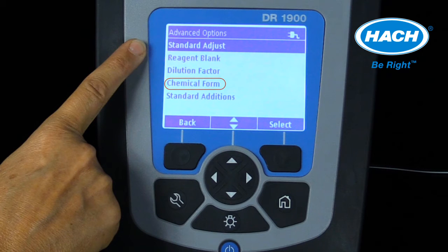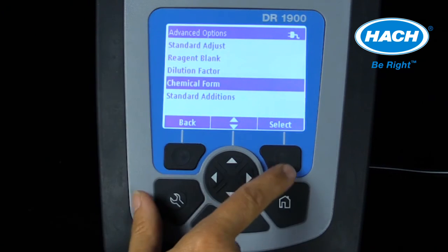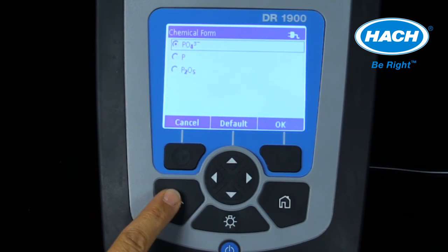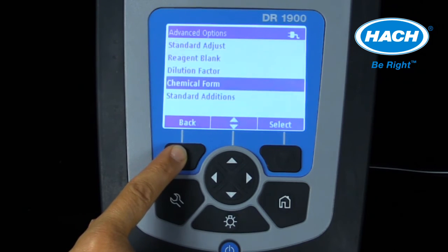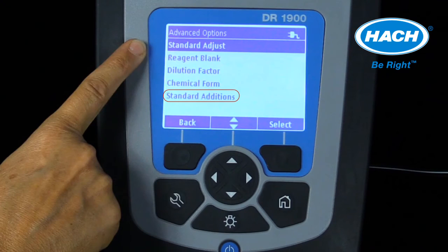The chemical form setting allows the alternate chemical form to be selected and displayed. An example of a chemical form change is from phosphate PO4 converted to phosphate as phosphorus, or PO4-P. The standard addition setting examines the reading accuracy by spiking the sample with a known standard.